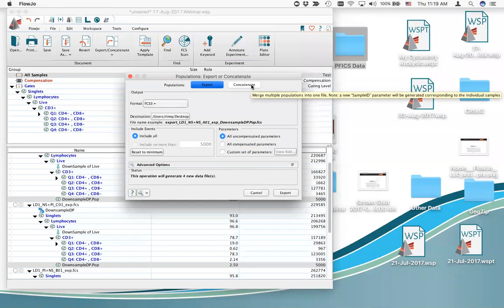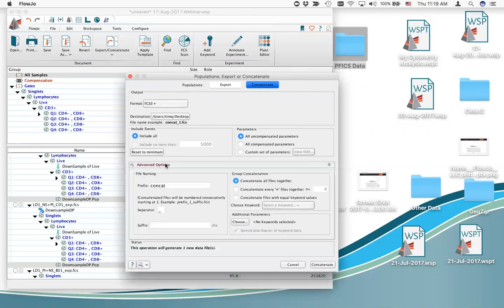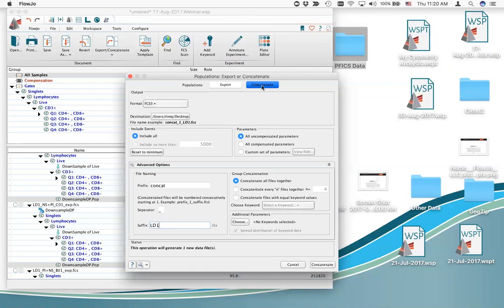First select the concatenate tab. It then gives a status saying 'this operation will generate one new data file.' Open the advanced options expandable box at the bottom — it allows you to add names. I'll label the file with a suffix of LD1, the patient ID nomenclature. Remember, if you want to bring it back into Flojo, export as FCS3 format. There are CSV options, but only use those if you're going outside of Flojo to another program.